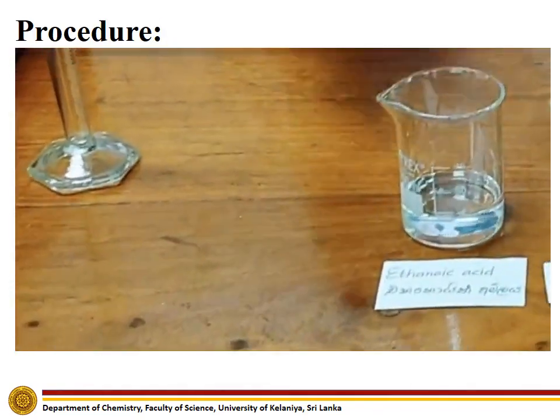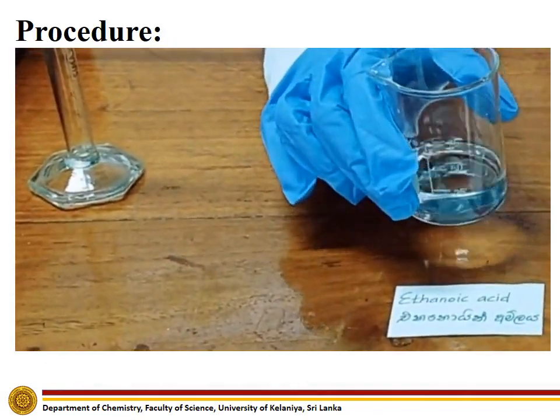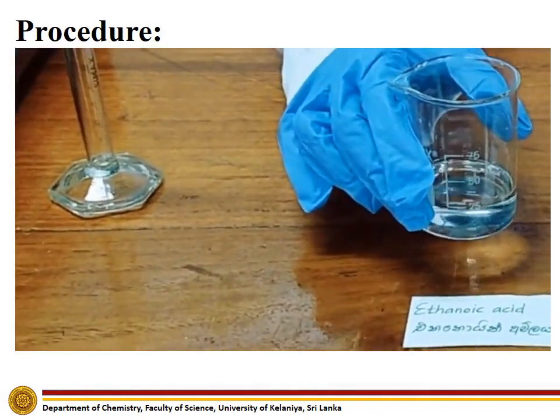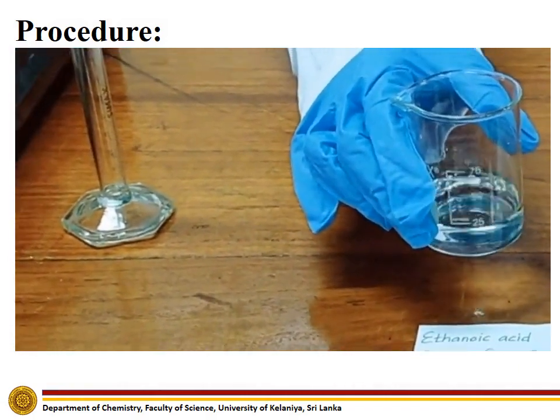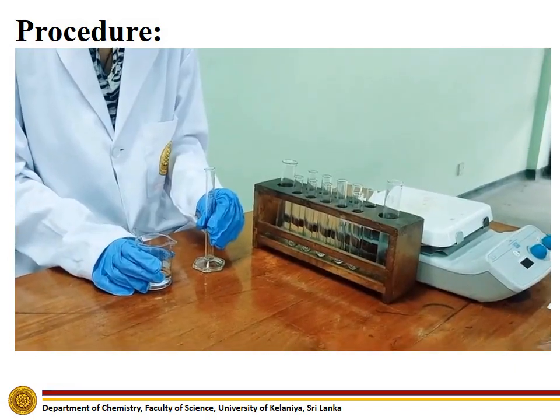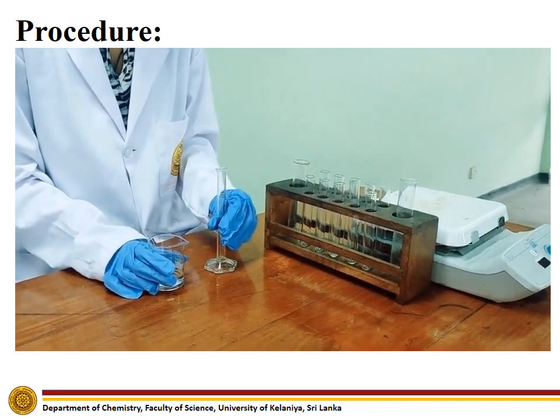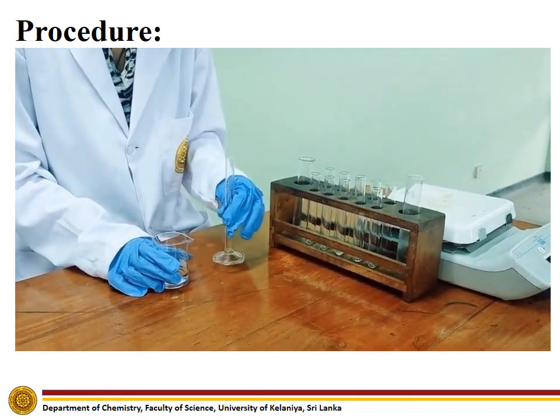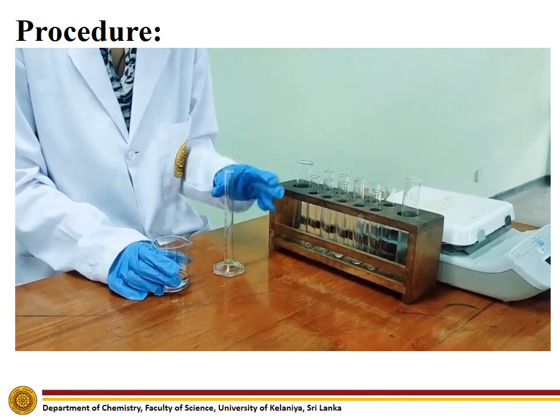First, we are going to perform all the experiments on ethanoic acid. For that, measure about 2 ml of ethanoic acid into 6 separate test tubes.